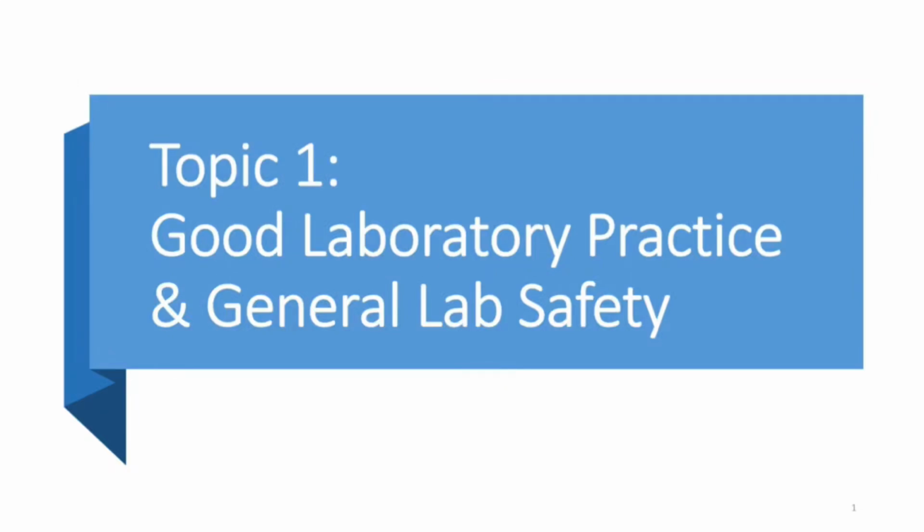In the first topic of this module, we are going to look at good laboratory practice as well as general laboratory safety.